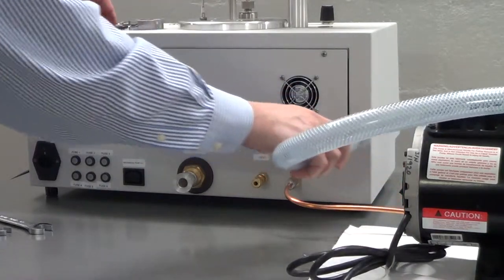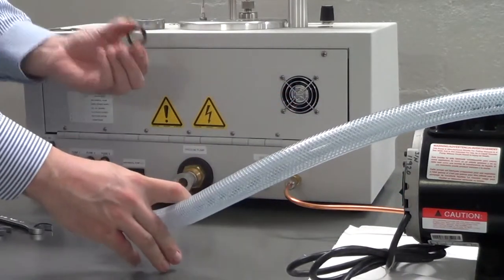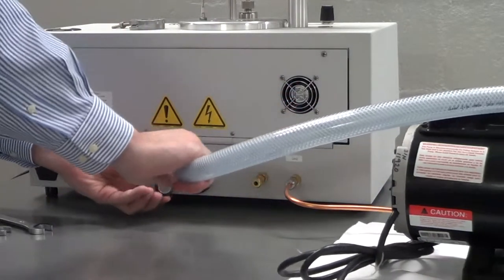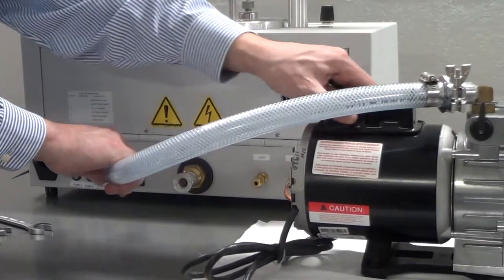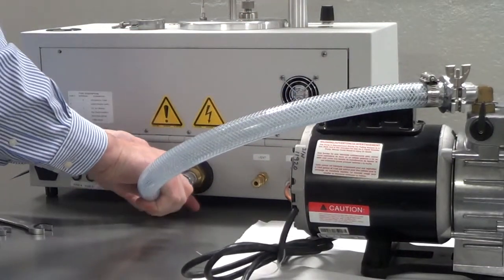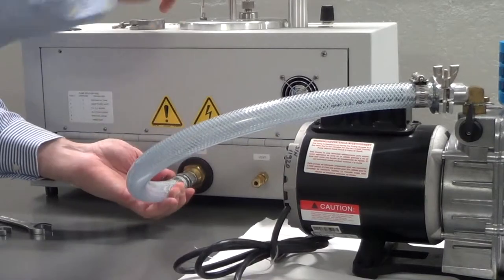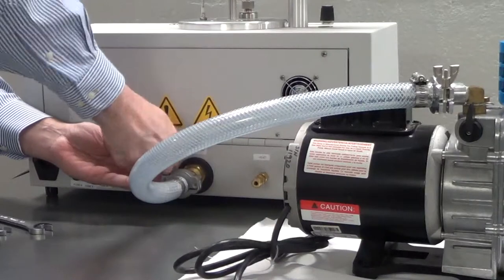Now you can connect the pump to the back of the system. This is a KF25 fitting, so you don't need any tools. Be sure the O-ring is aligned properly and tighten the clamp. Hand tight is sufficient.